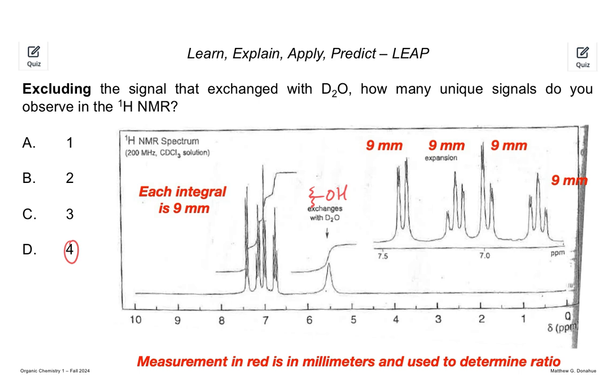So this first one, this is a doublet, this is a triplet, this is a doublet, that's a triplet. You got a little sort of Mordor horns on them. I call these Mordorplets. That's just finer splitting. So the coupling is sort of, there's more of it.